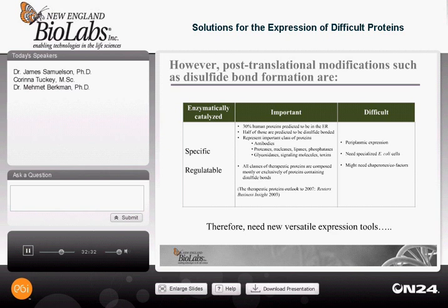However, making disulfide bonded proteins in E. coli is not easy. One needs to either secrete it to the periplasm where the oxidation occurs, or you need to use specialized E. coli cells such as the SHuffle cell I'm going to talk to you about today. Even so, these are not guaranteed to solve the problem, and one might need to further engineer the protein, the strain, or express chaperones to get correctly folded proteins. So it is therefore quite essential that we have new and versatile expression tools to address any protein folding issue.